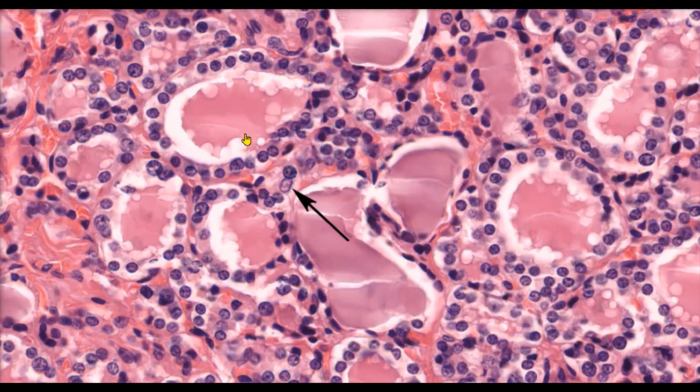Now, outside of our follicle, if we zoom in, see this arrow here? It's pointing to this cell right here that's kind of lighter in color. This cell doesn't belong to any of these follicles. It sits next to the follicles. So we call it a parafollicular cell. Para means next to. The parafollicular cells secrete a hormone called calcitonin, which is involved in calcium regulation.